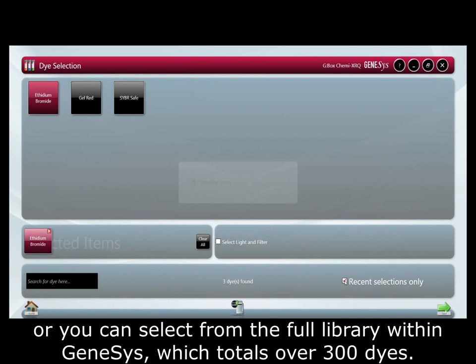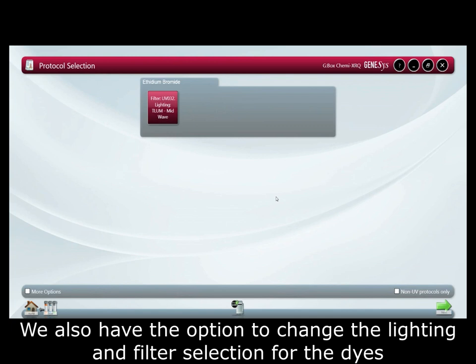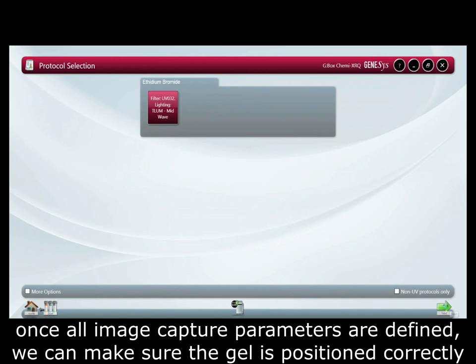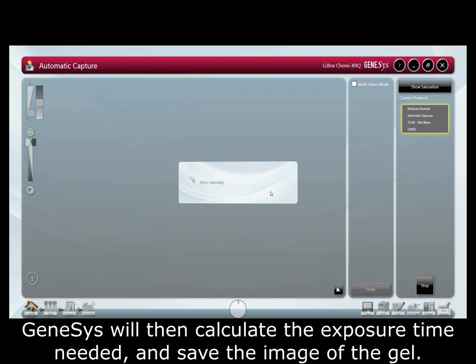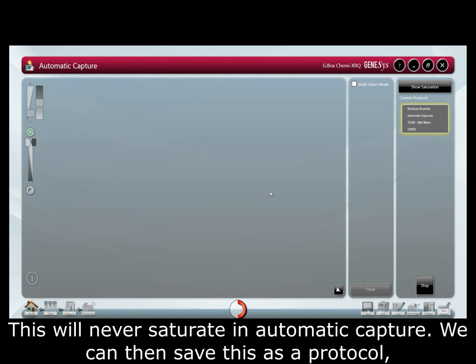The next step is dye selection. This will bring up a recent selection of dyes used, or you can select from the full library within Genesys which totals over 300 dyes. We also have the option to change the lighting and filter selection for the dyes. Once all image capture parameters are defined, we can make sure the gel is positioned correctly with the image preview, which gives options such as lens control, iris control, and zoom or focus. Genesys will then calculate the exposure time needed and save the image of the gel.